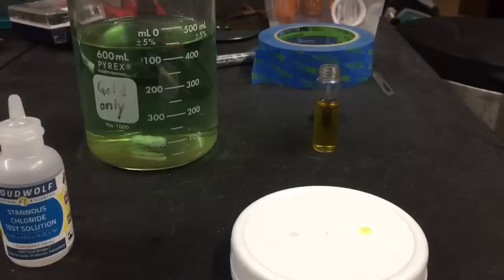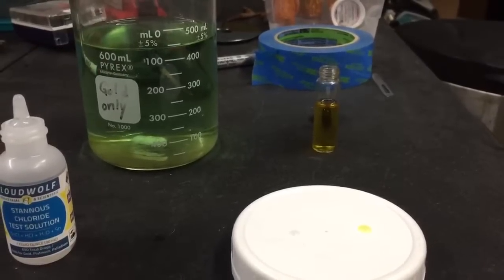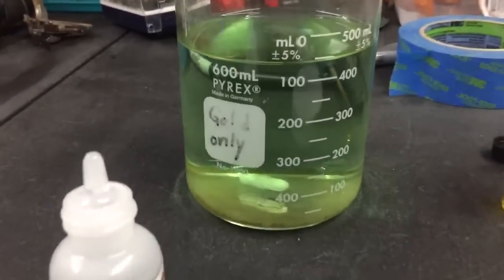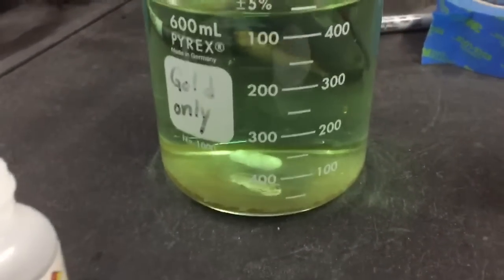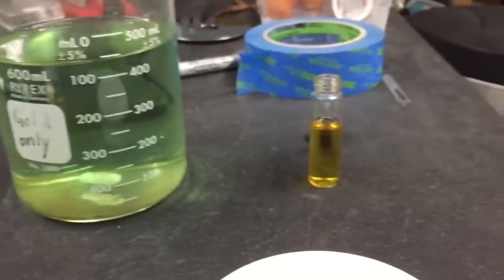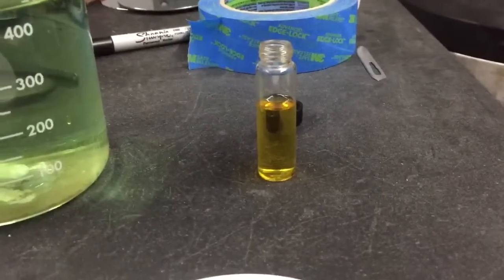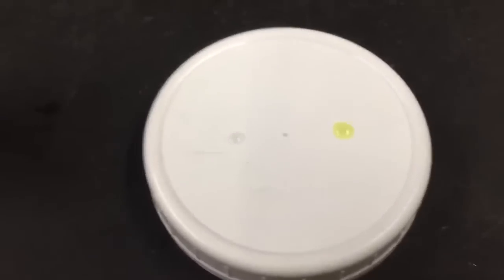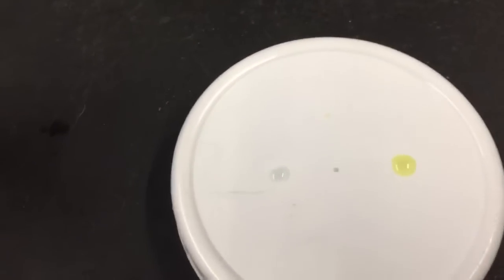What I'm going to show here is a stannous chloride test with a solution known to not contain gold, because I dropped the gold out of this solution earlier today, and a solution known to contain gold. I've placed drops of both on this white lid here, and now we're going to add stannous chloride.